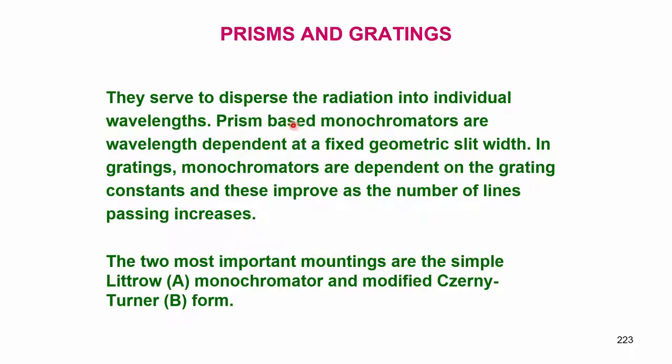Okay. So, we are talking about prisms and gratings. Why? We need to separate the hollow cathode line coming from the flame. And what should the hollow cathode line radiation source be separated from? It is to be separated from emissions from the flame, emissions from other elements, and emissions from CH, NH, cyanogen, and other broadband molecules.